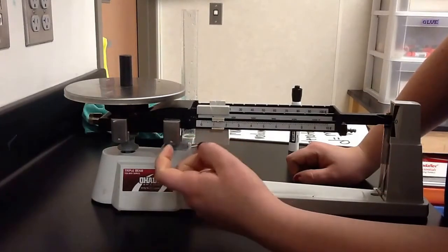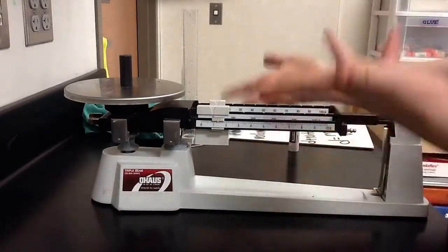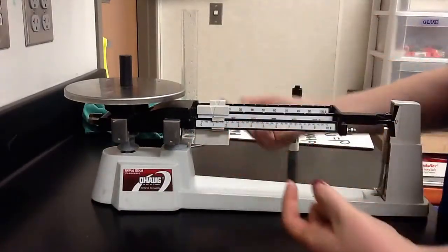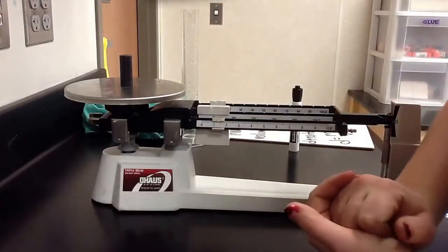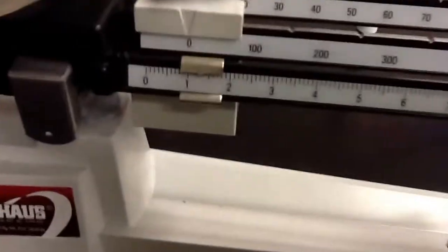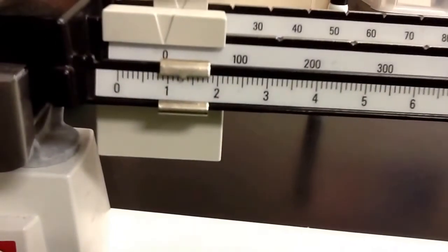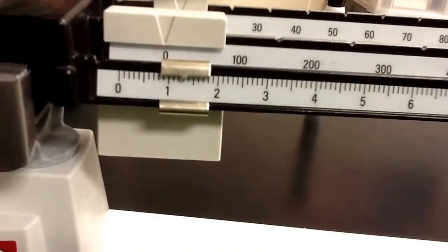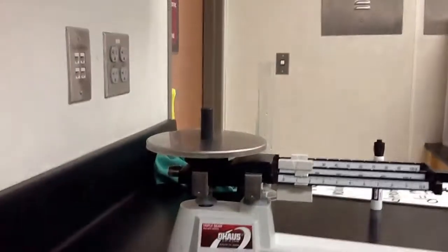Almost. Perfect. Okay, so to get the mass, we just add these two together. 10 plus 1.3. Remember, every little line in between goes by 0.1. So that lands on the third line after 1. So that's 1.3 plus 10 is 11.3 grams for that cylinder.